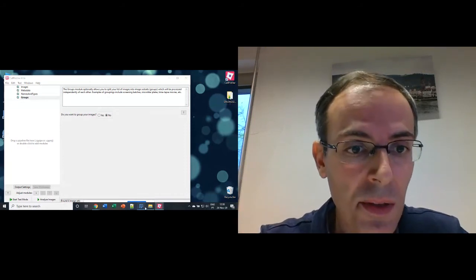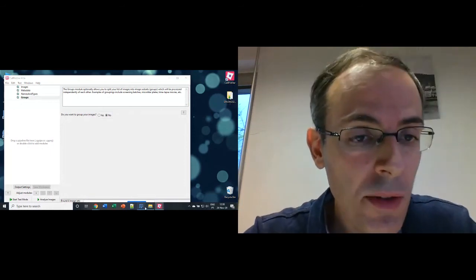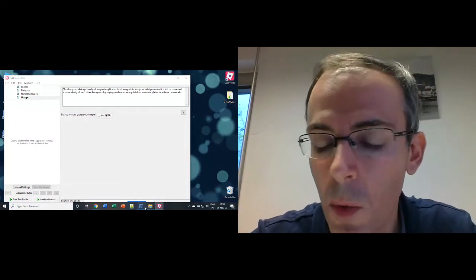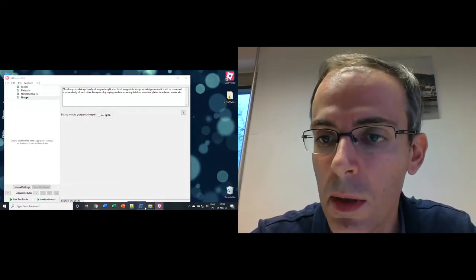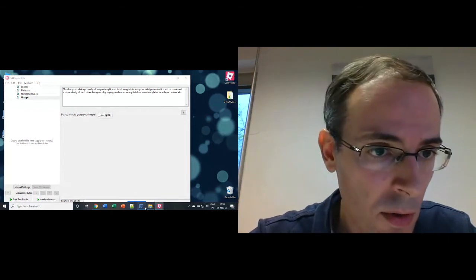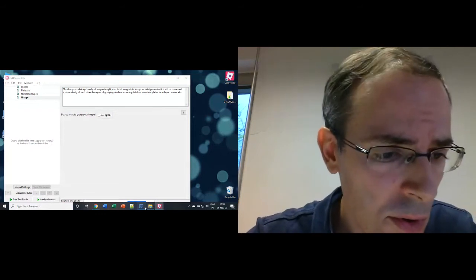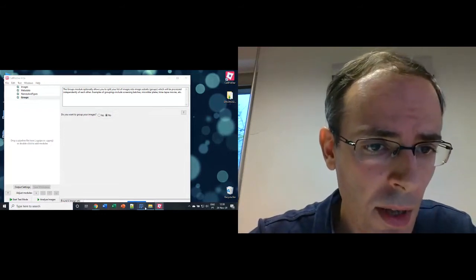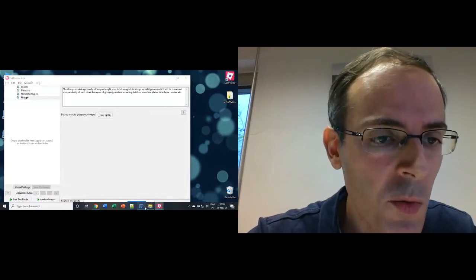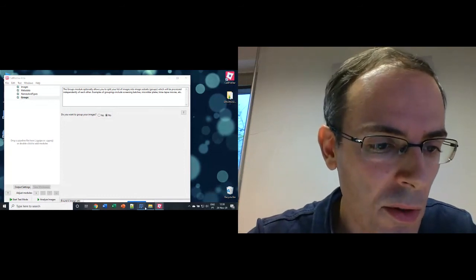So this is a nuclear stain, and to get information from individual cells, maybe the first step we want to add is a threshold. So let's do this. To add a module, you can either right-click and check what is available in terms of image processing, object processing, and all sorts of categories.